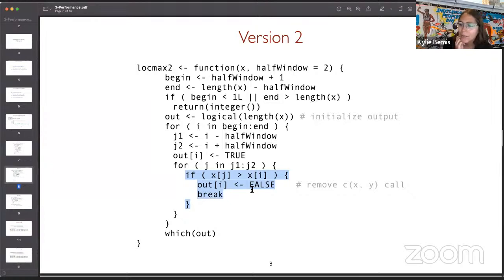Markov chain Monte Carlo simulations generally need to be some kind of for loop if we're relying on anything that relies on a previous value. So anything that's iterative and relies on the previous iteration is going to require some kind of for or while loop. So there are definitely situations where you have to use a for loop. But even when you can remove a for loop, we'll see if it's always worth it.